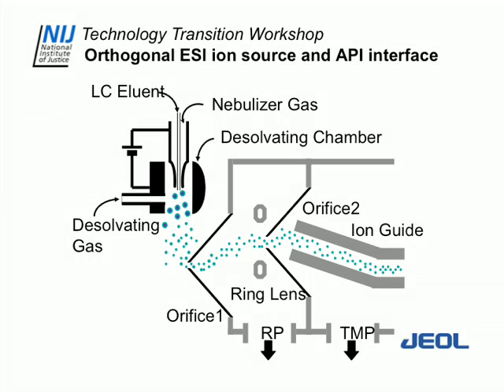So you want to trap the contamination if you're analyzing peanut butter, carpeting, or some kind of material; you don't want to blow that into an ultra-high vacuum region. So we ran DART for about a year the first time, and we found out, we put the electrospray source on one day, and we saw a flicker, and then the signal died.